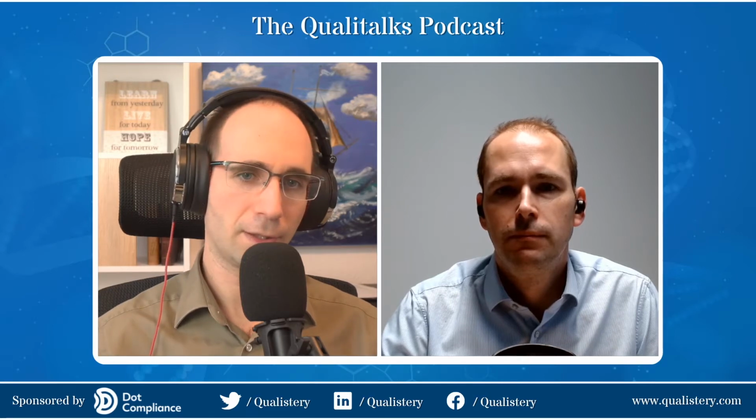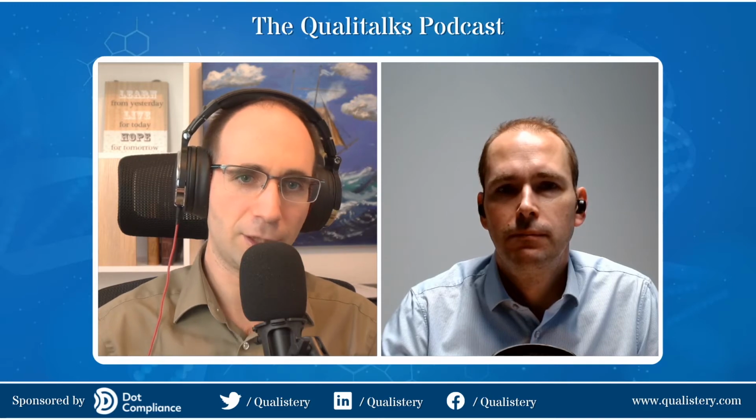Right. So it sounds like a lot of playing around with the functions and with the engineering of it, a lot of simulations. So how do you perform it basically? With what parameters do you need to look at? So are we talking about engineering that takes into account the volume, the amount of the equipment or the materials that you put inside, and the size of them and the material they're made of, and that all comes to the circulation and the parameters of the device, and then you see how you can adjust or change it, right?